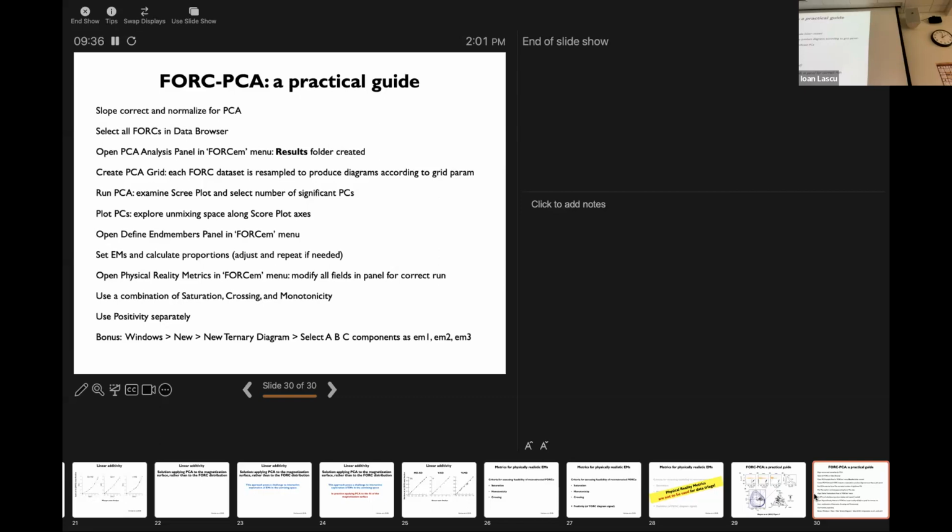If you know there are more processes at play, would that help you? That might be useful. It's always useful to know, but usually you hunt for the process. You're trying to figure out what's going on, or trying to find the end members from a mixture. If you have additional information, maybe PCA or this kind of unmixing is not needed, but I haven't seen any examples of that. But thank you.